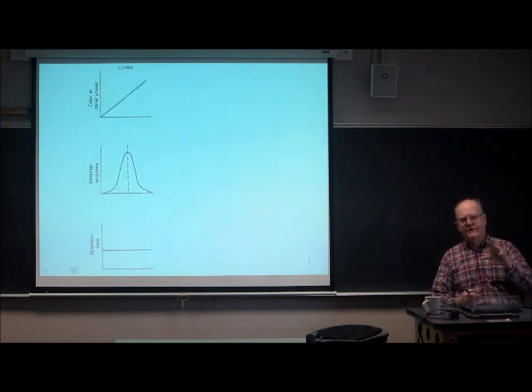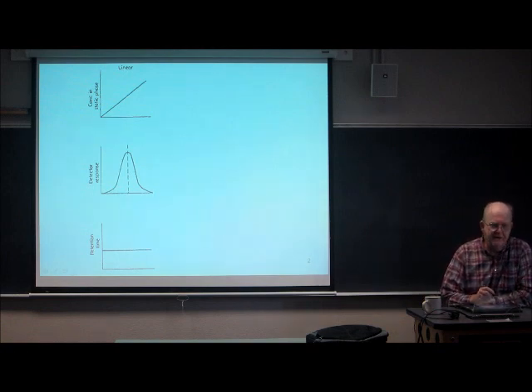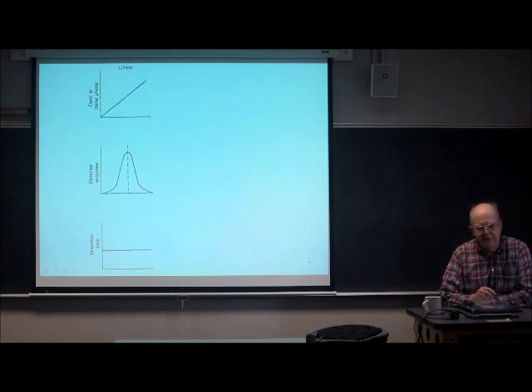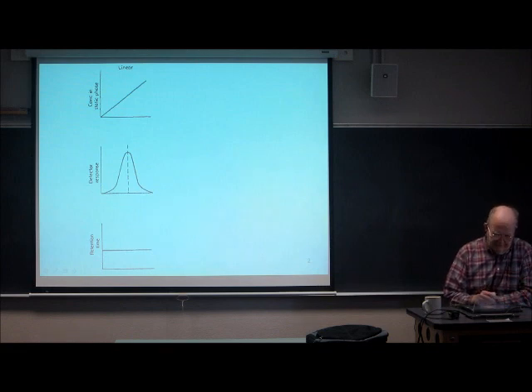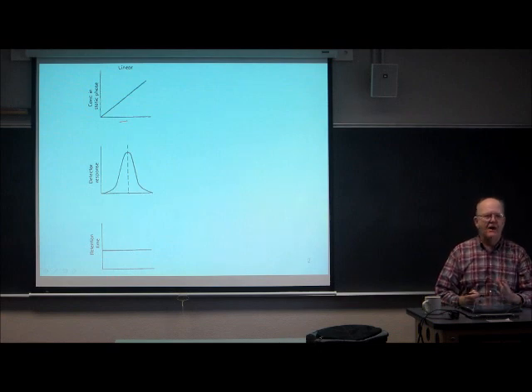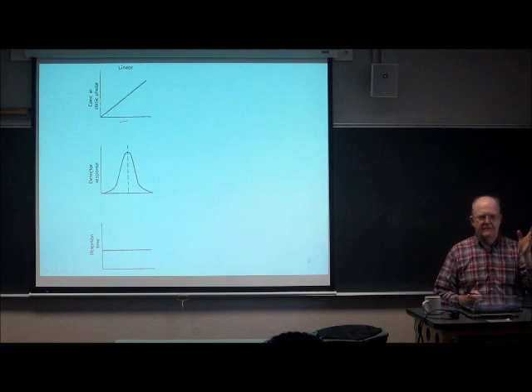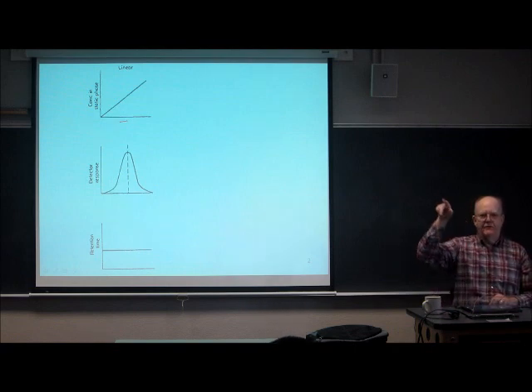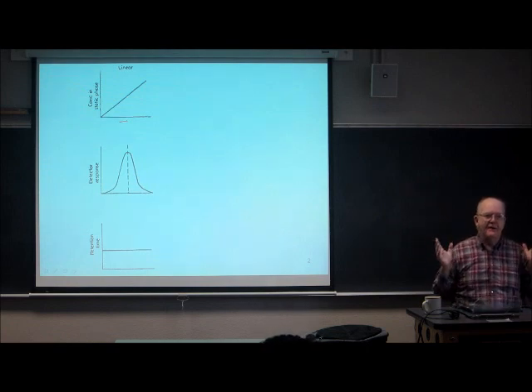Okay. What we've been talking about so far is what's called a linear isotherm situation. And in the linear isotherm, the concentration of the stuff in the stationary phase at equilibrium is linearly related to the concentration of the stuff in the mobile phase. That's down here. What I mean is it's a straight line and it goes through the origin 0, 0. We've written K equals concentration in the stationary phase over concentration in the mobile phase a lot. This is a plot of that equation.